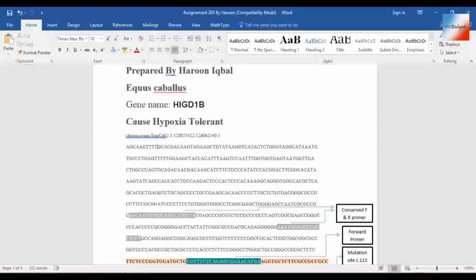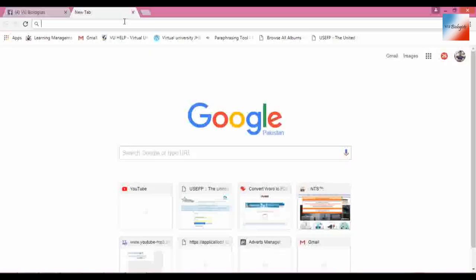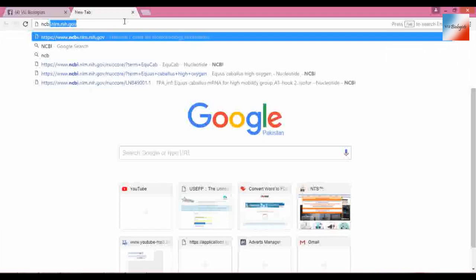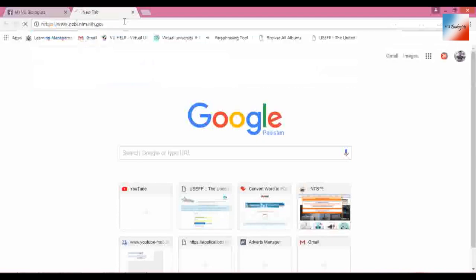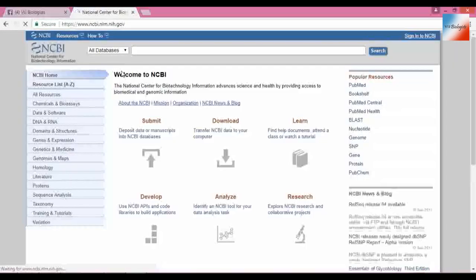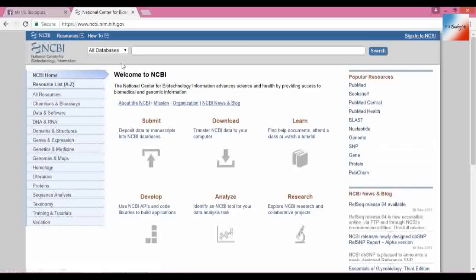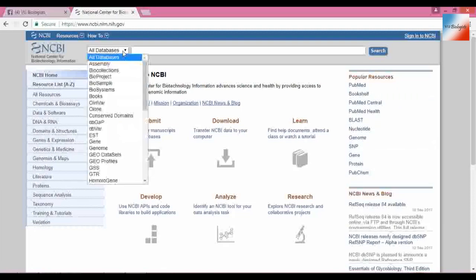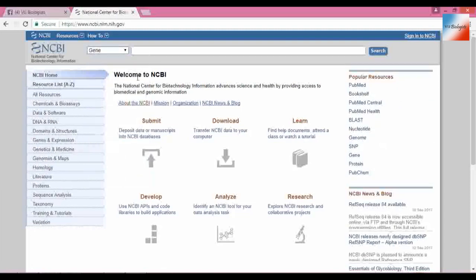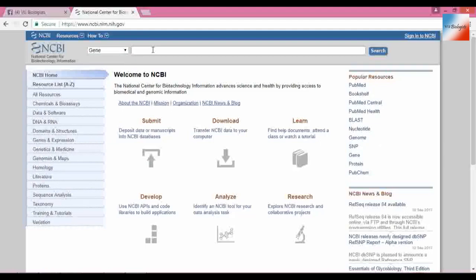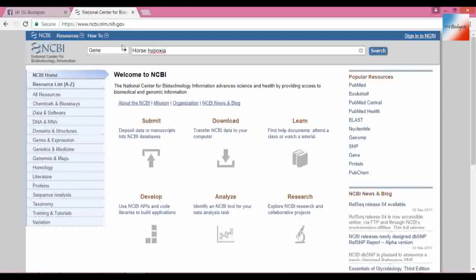First we need to go to the NCBI website. Here we need to select the gene that we need to find, the gene we are looking for. And here I will type 'horse hypoxia,' that's it.